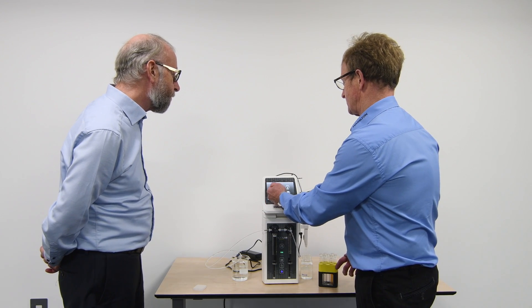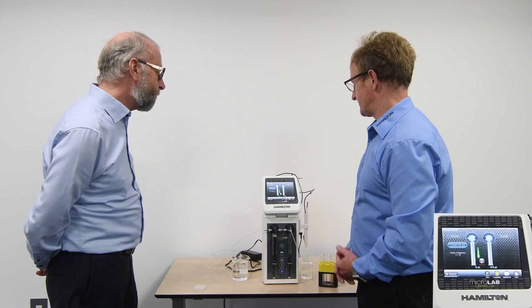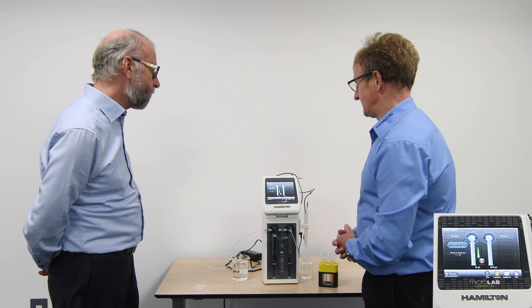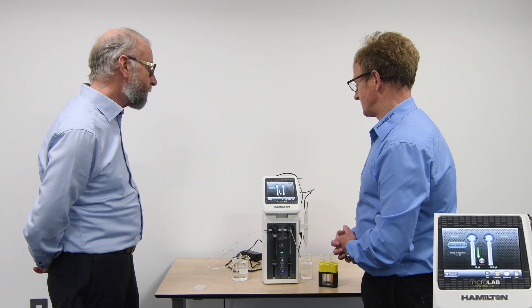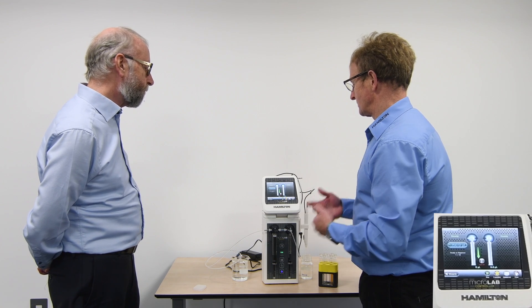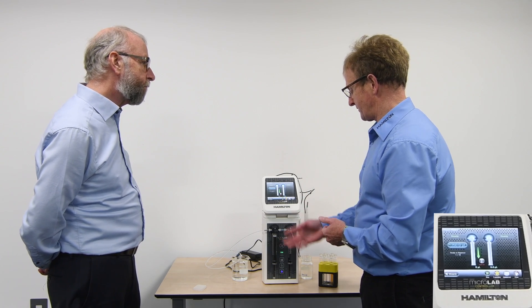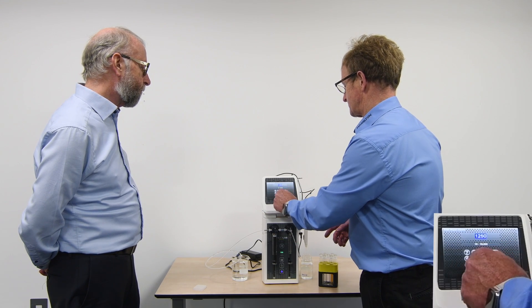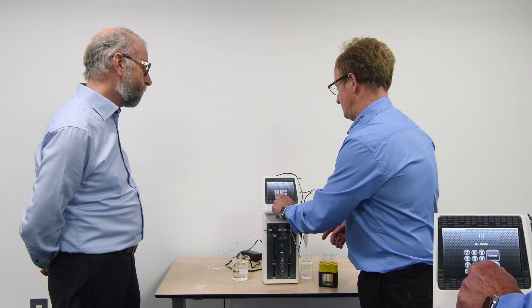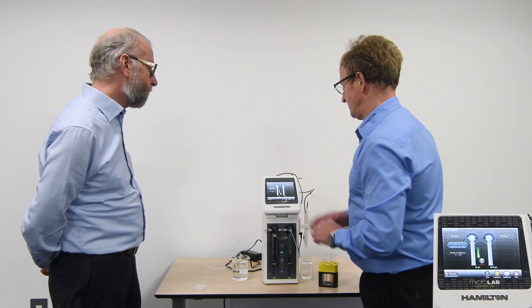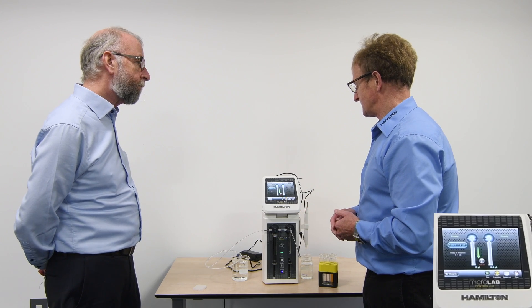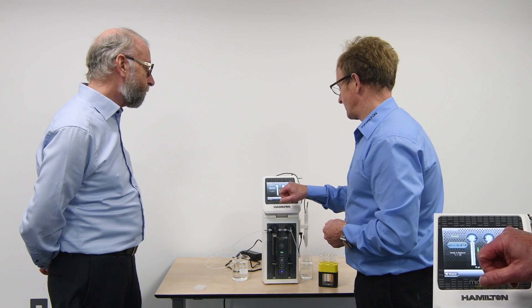Much like the dilution wizard, when we go into aliquot dispenses, it's pretty straightforward. It's just given us an option there to select the amount of reagent that we wish to dispense and it will actually calculate how many from an individual aspiration it was about to fill. So if you're 1 ml, you suggest that we can put 1 ml in, 1000 microlitres. Because this is a 10 ml syringe, it's showing 10, and what will happen here is we're going to put on the refill function here.